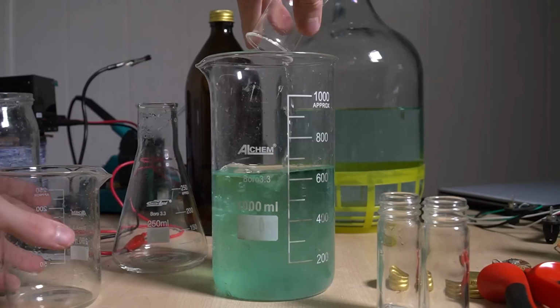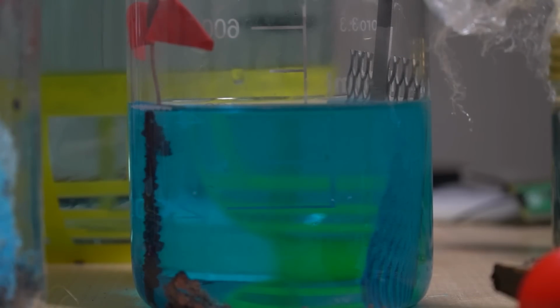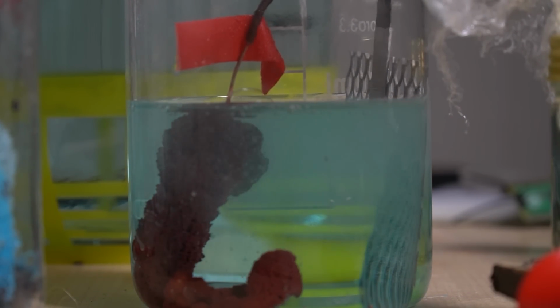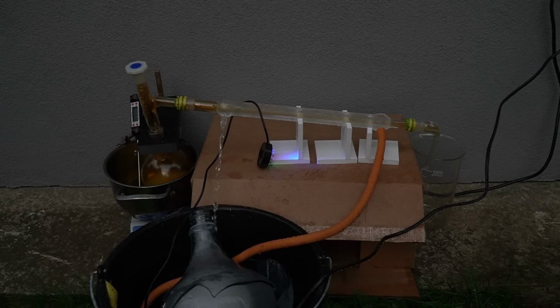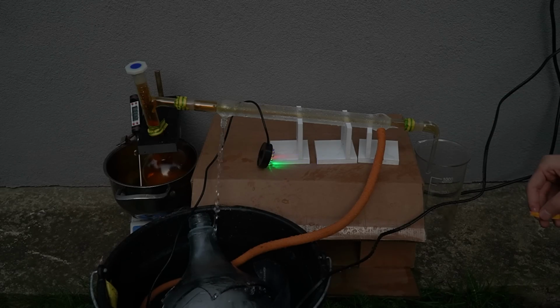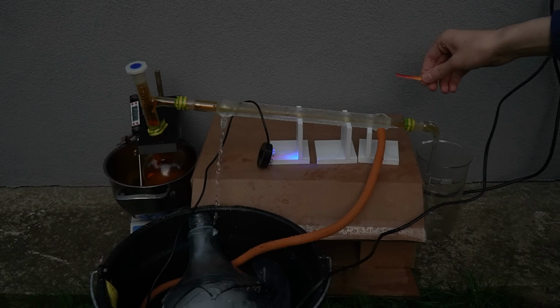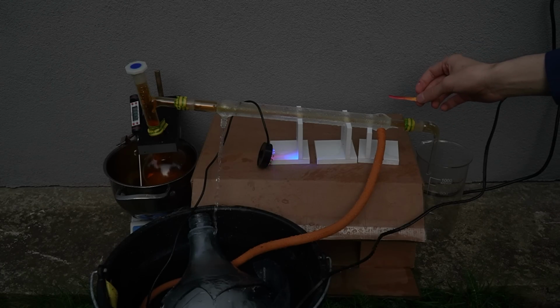Then, after a quick break of mixing every single acid I've got, electrolyzing it even more and concentrating it, it was finally time to do some actual professional chemistry. I mean, okay, I'm doing the best I can with the resources available, alright? That right there is red. Now, red is really good, because that most likely means it should be nitric acid.